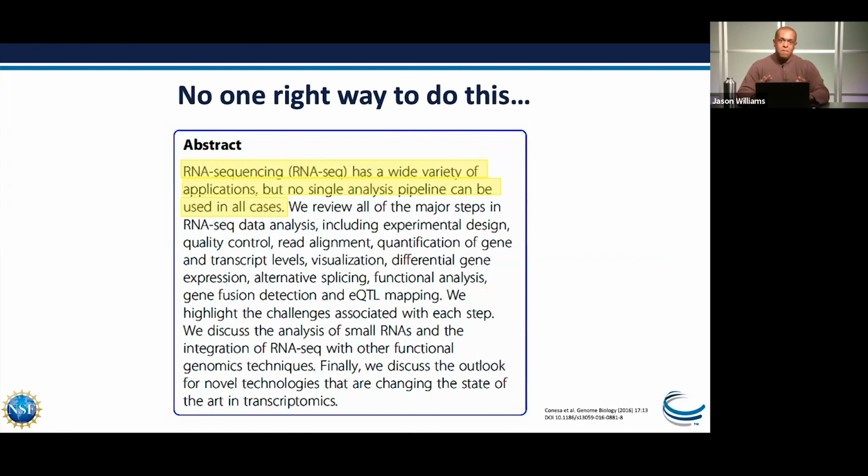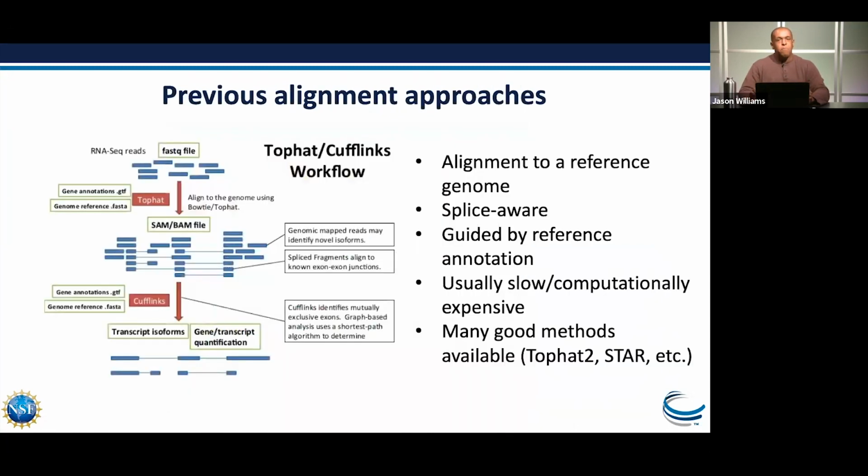So in the former constitution of the Green Line, we used the Top Hat Tuxedo, which I'll mention in a moment. Now we've moved to Kallisto, which really covers a lot of bases, but may not cover every base. Conceptually, since the DNA Subway really is a teaching tool, we feel that we've placed down the fundamental things you'll need to think about in introducing some of the key topics of RNA-Seq, and also topics like big data and how that works in biology currently. Previously, as was mentioned, we used something called Top Hat and Cufflinks. Now, there are actually new implementations of the Top Hat workflow, which one could use, but there are several reasons why we chose to use Kallisto and Sleuth.